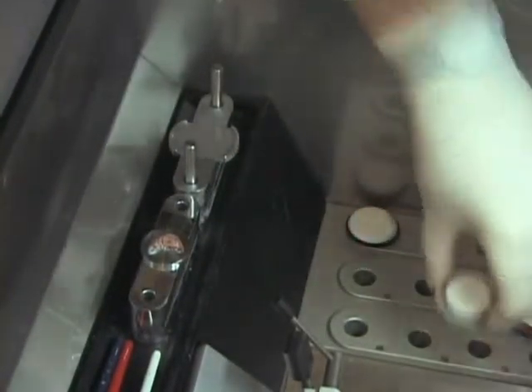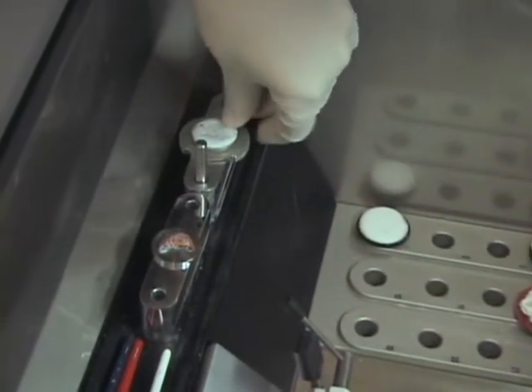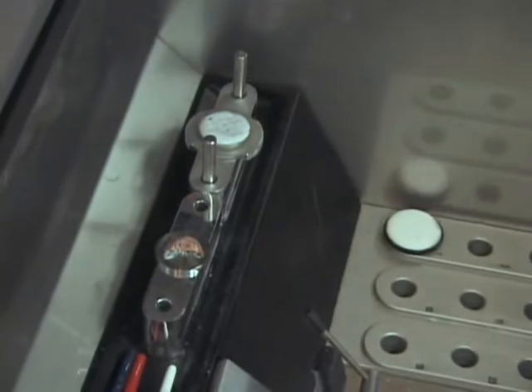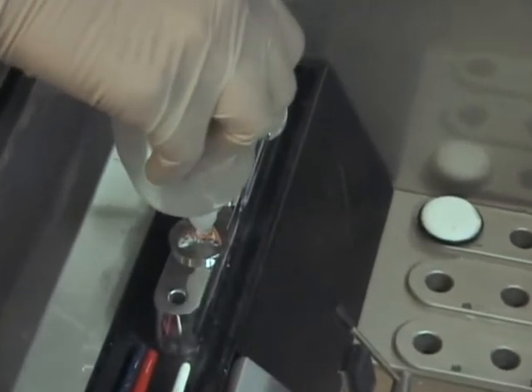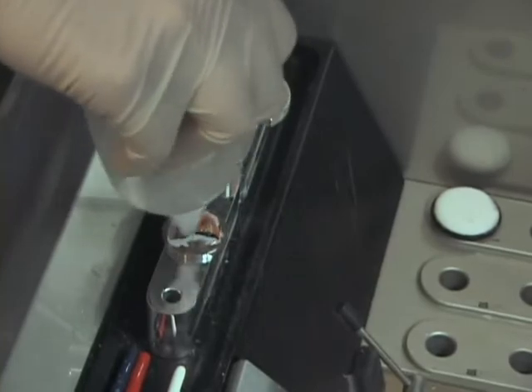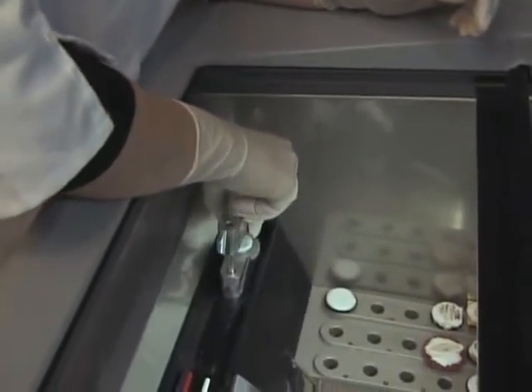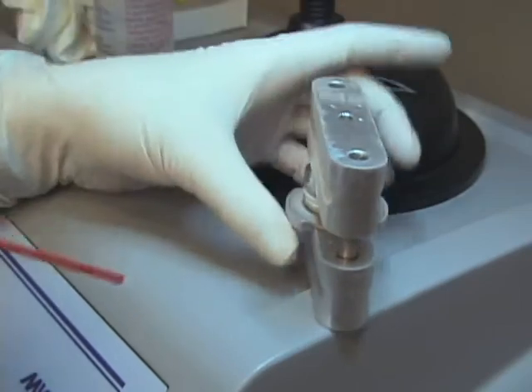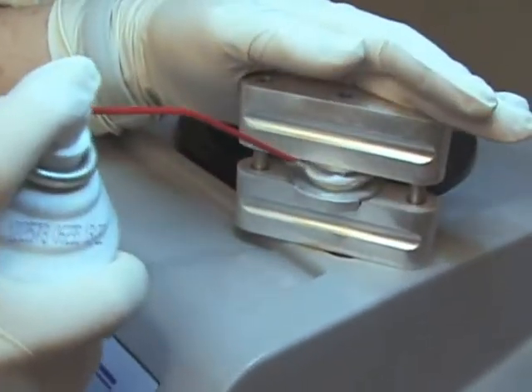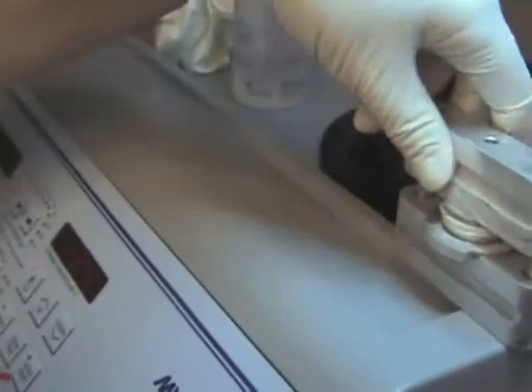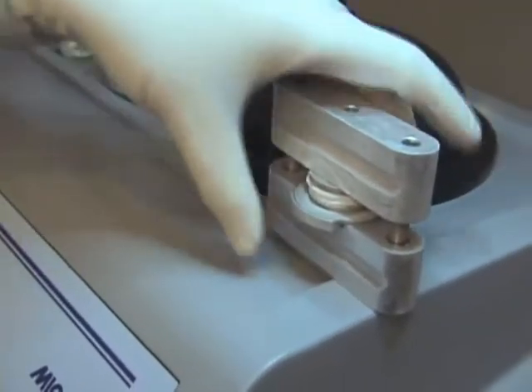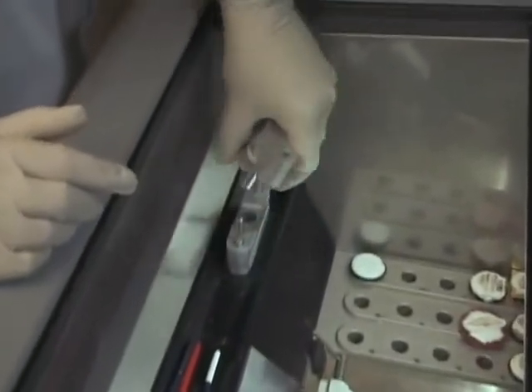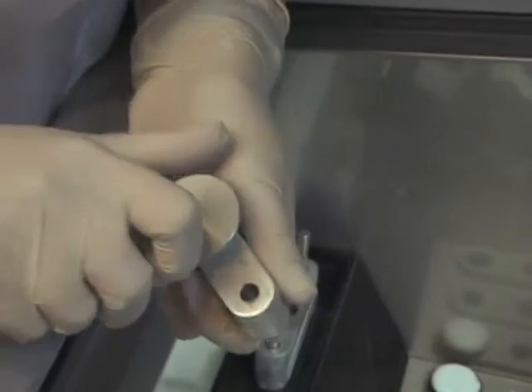This adapter is used for the regular and large size Thermal Shandon chucks. A technician's least favorite part of tissue processing is adjusting and readjusting the chuck holder so the specimen is parallel to the blade. When using the cryo-embedder to freeze and orient specimens, each specimen is lowered onto the posts at the same angle, so very little if any adjustment will be needed when cutting. This system is economical. There are no accessories that need replenishing or disposable parts to wastefully throw away. Perfect yet simple and easy.